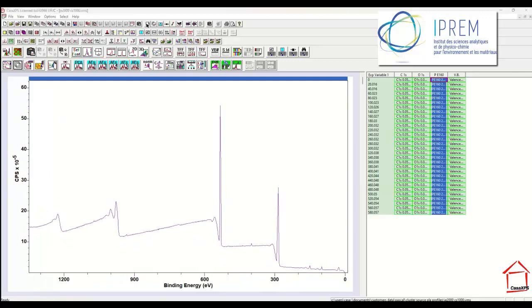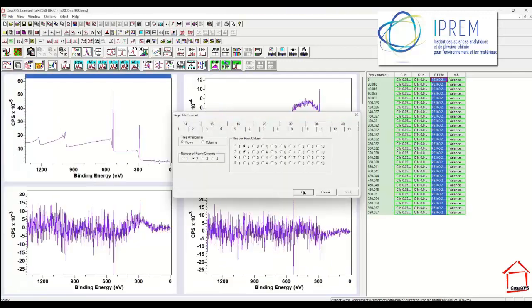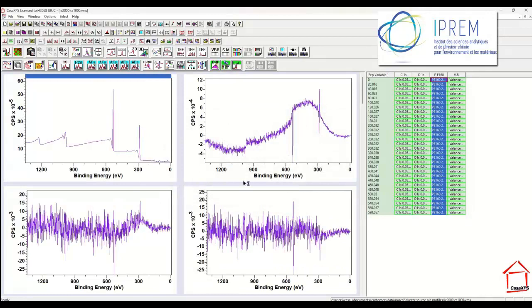Let's display 4 abstract factors. And in fact, only 2 of them are sufficient to make us aware of what is happening for this particular sample. So here's the average spectrum as calculated by PCA. It's not quite the average spectrum, but PCA works out the greatest variance in the data and presents that as the first abstract factor. And then the second abstract factor is the greatest variance once the first one has been removed from the data set.